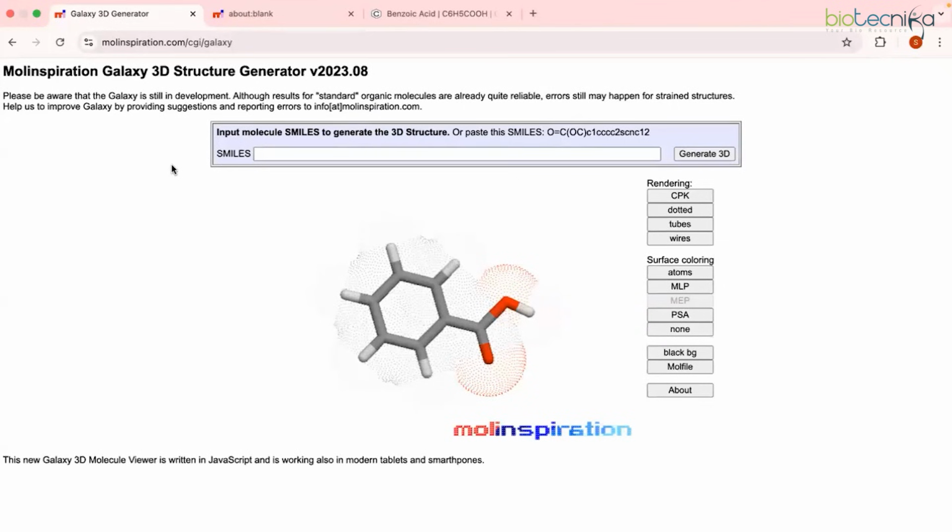The best practices for using Molinspiration are to always validate the descriptor outputs, check for errors and flags. Also use it in combination with other tools, like docking, ML and simulation studies, to get it combined with tools and optimized. Also for large libraries, you can use the command line, the bash methods if available. Just use the descriptors sensibly. You can avoid the over-interpretation with any tool that is applicable.